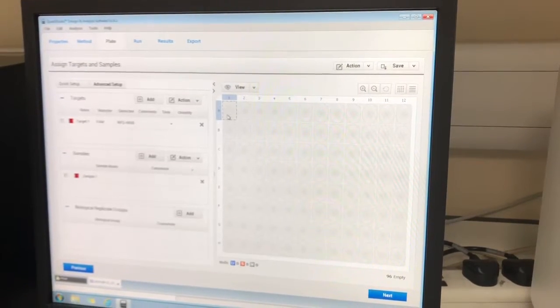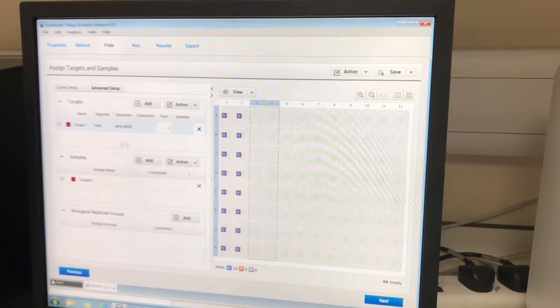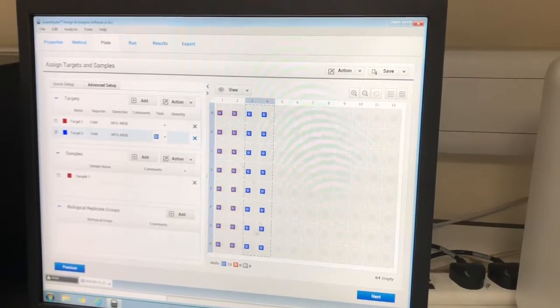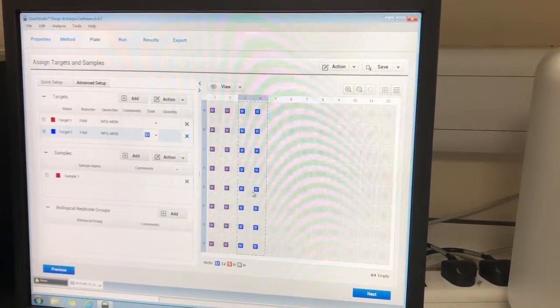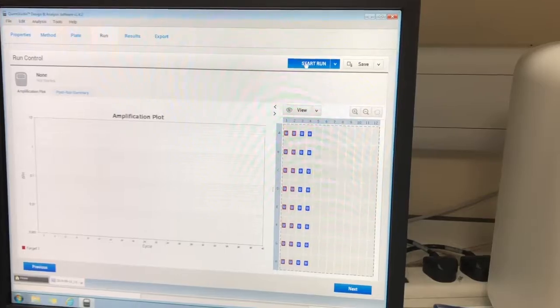And then we just have to tell it what we're running in the wells. So we've got 2 genes today that we're looking at, and we just have to tell it that we're running 2 different genes for these 16 samples here, some healthy control samples and some patient samples, and then we go into the next screen and we start the run.